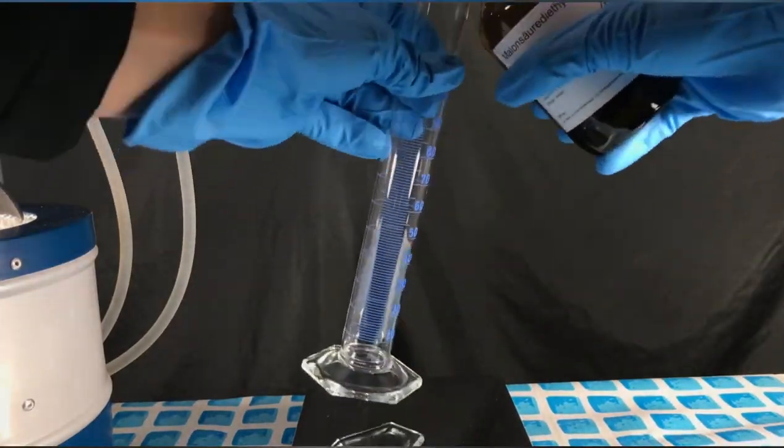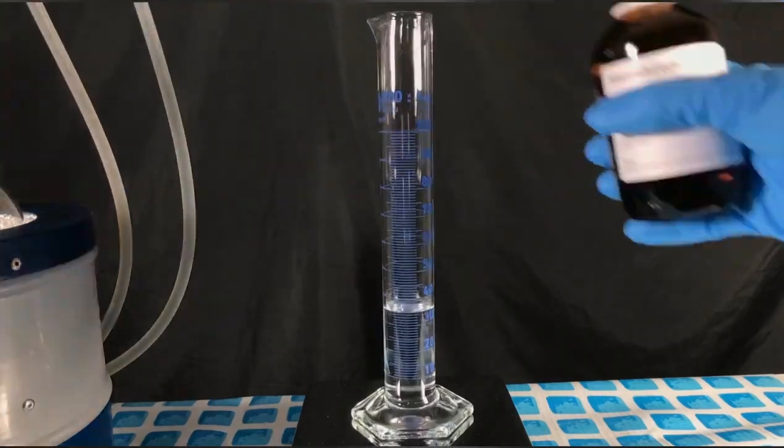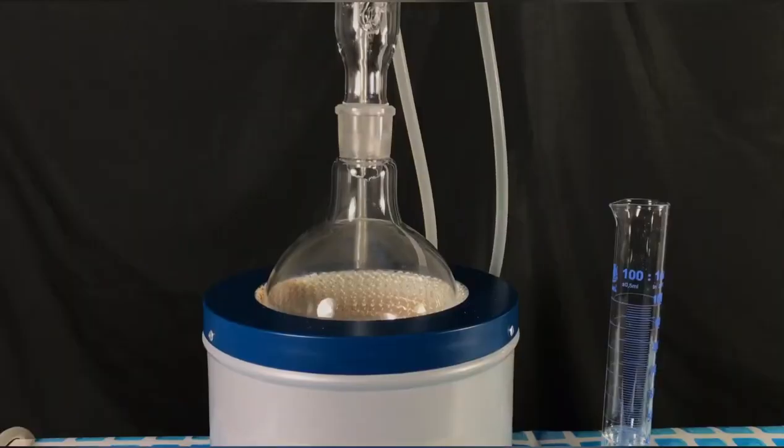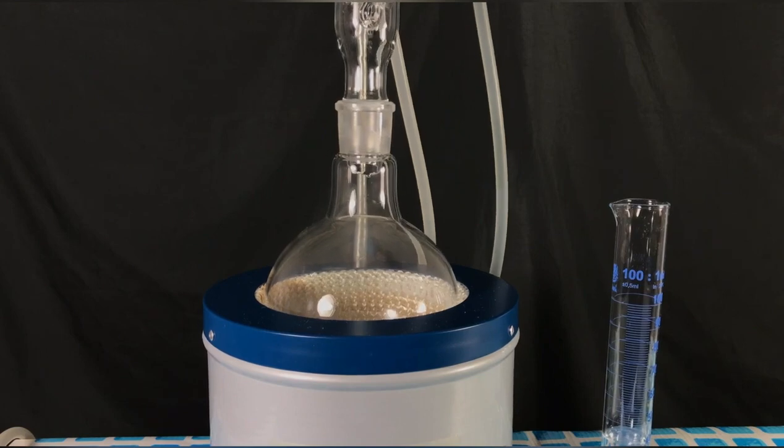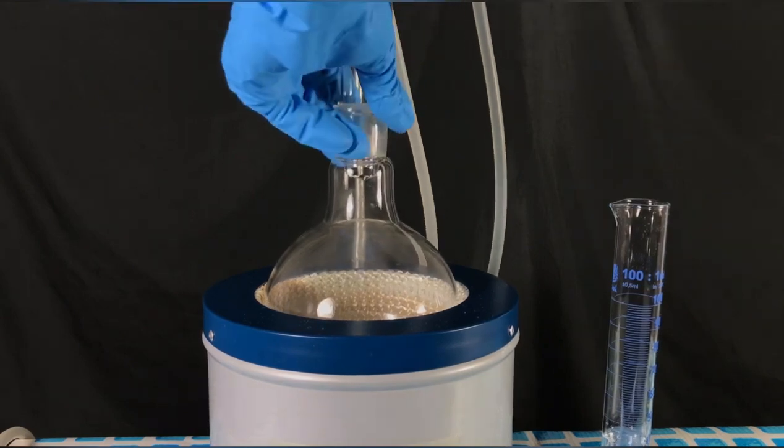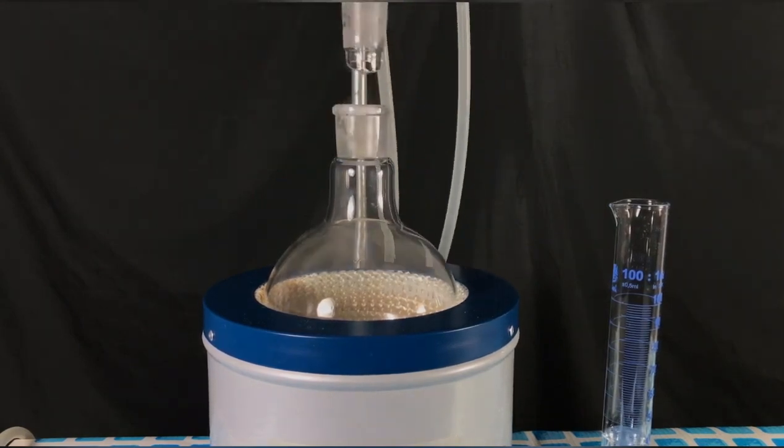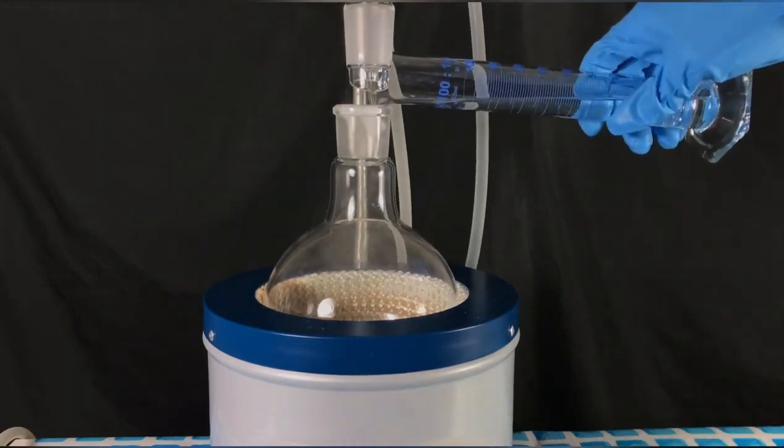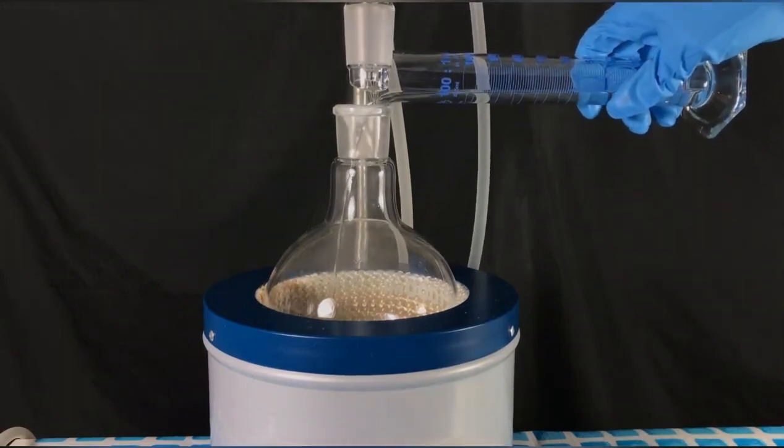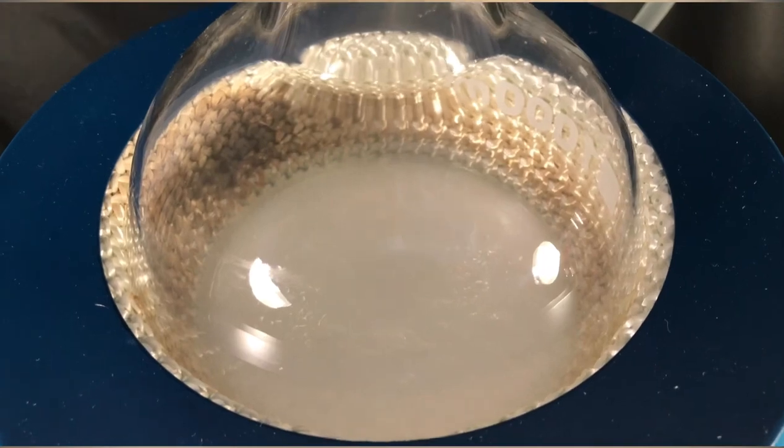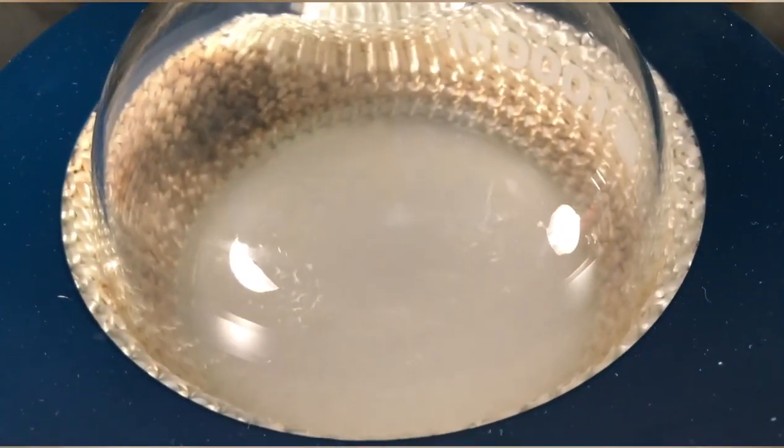40 grams of diethyl malonate were weighed out. The reflux condenser was then removed and the diethyl malonate was added to the round bottom flask. After the addition, this white solid chunk was formed.